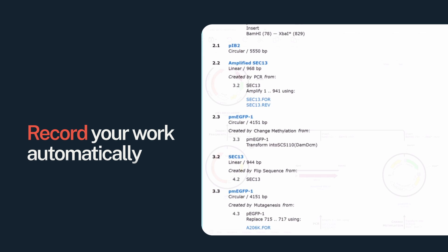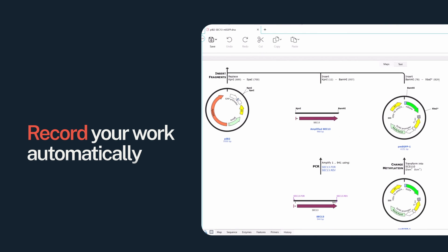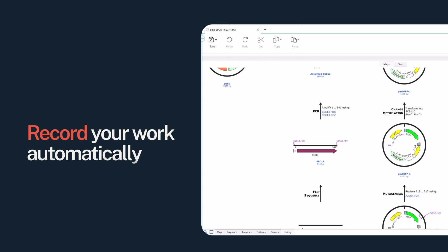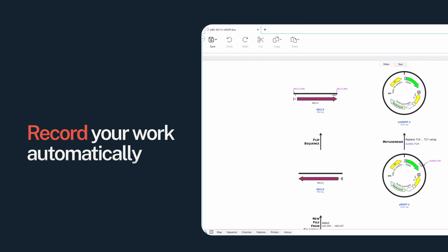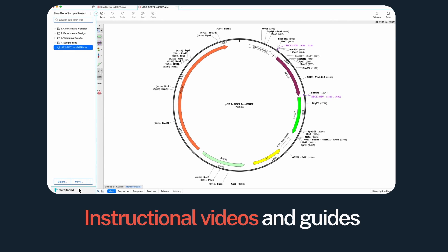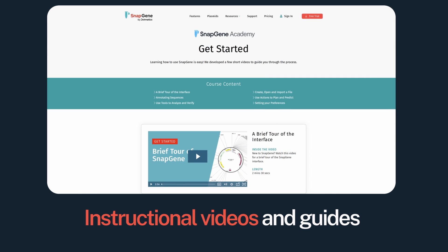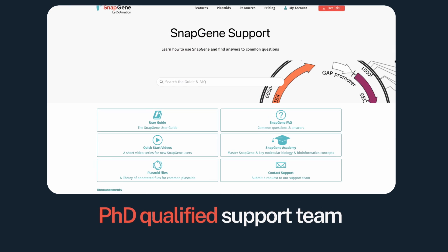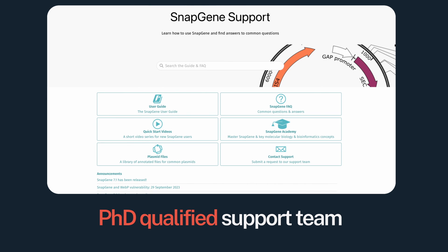SnapGene even automates documentation so you don't have to — see and record every sequence edit and cloning procedure automatically. And if you get stuck, SnapGene has plenty of instructional videos, guides, and a dedicated team of qualified scientists to help.